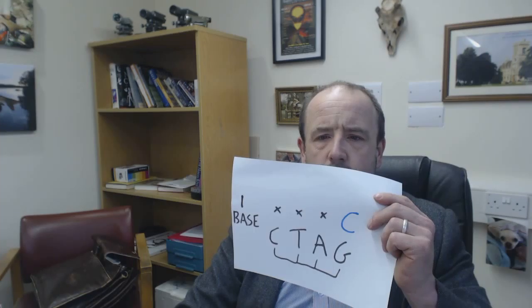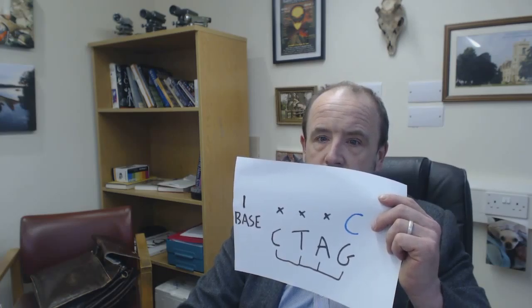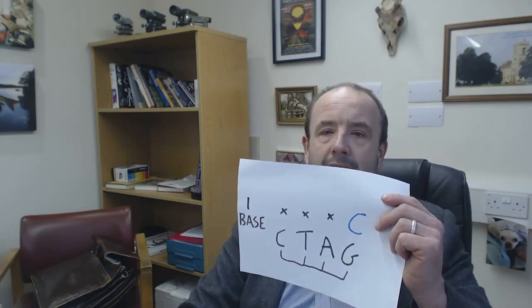We pop in our fluorescent dideoxynucleotides and our non-labelled deoxynucleotides, and we heat up the reaction just like PCR.